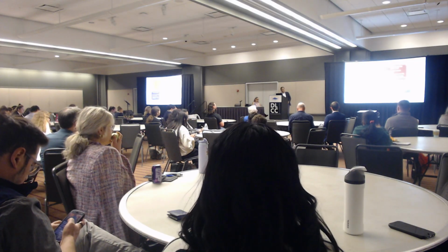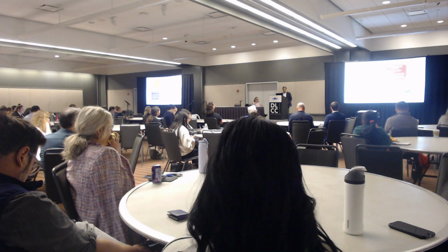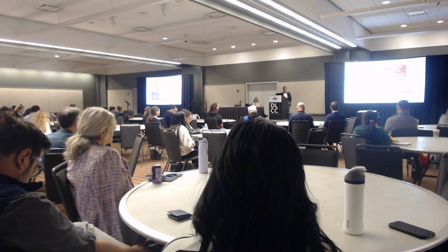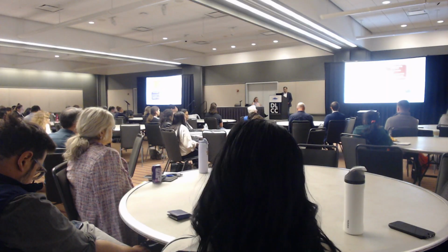So this is a little bit of the project workflow that anybody entering the core follows. As scientists ourselves, we know a lot of these folks want to do epigenomics, but they don't know where to start. So that's our job, to advise them on the best assay, what samples you would need, and what kind of sample preparation needs to be done.